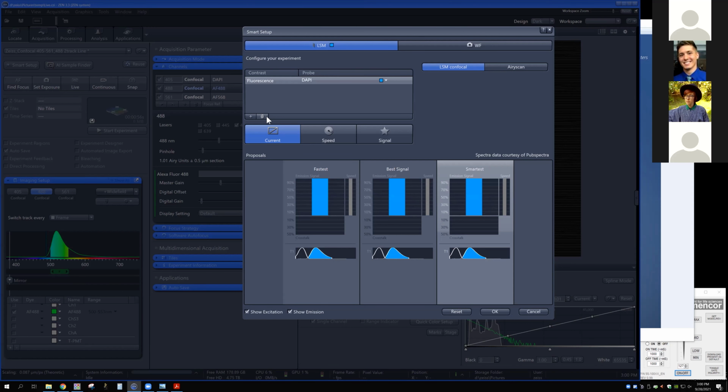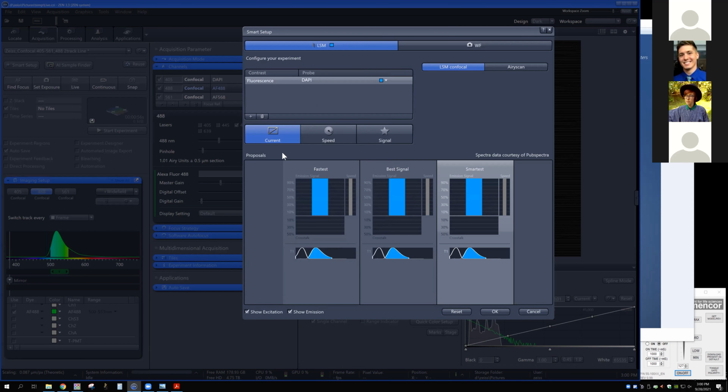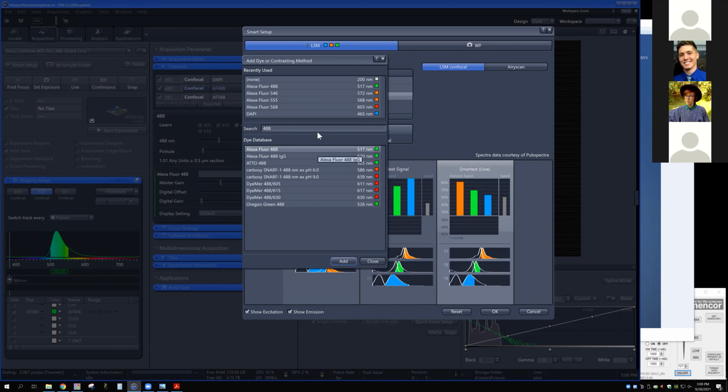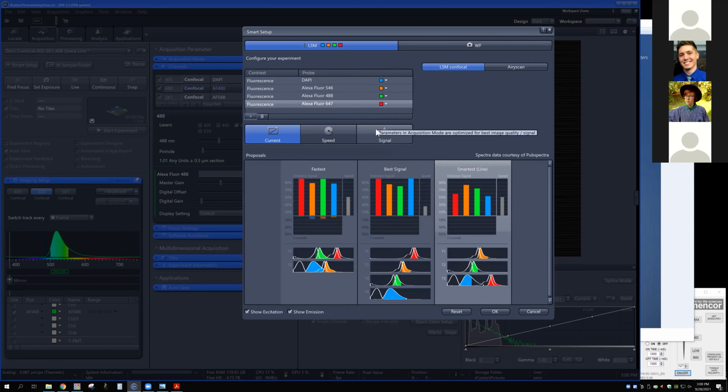So name your favorite fluor. We use 488, 546, 647. Okay. All right, here we go.